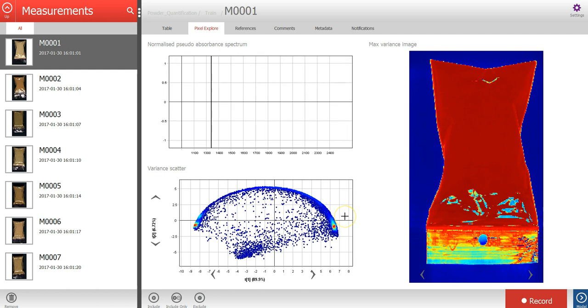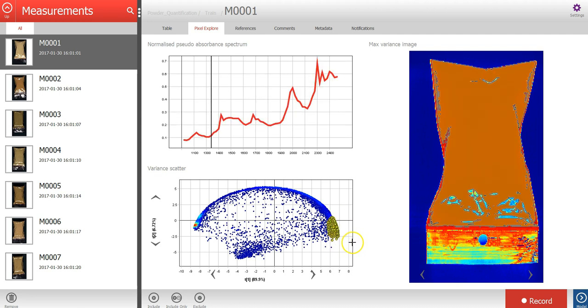By selecting a cluster of points, you can see where these pixels are located in the image, and also the average spectra for that selection.